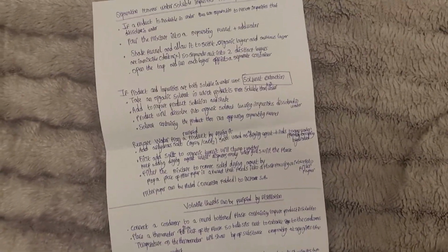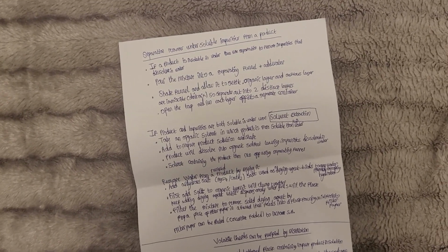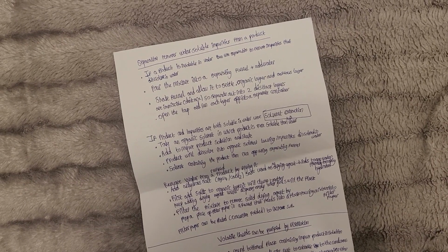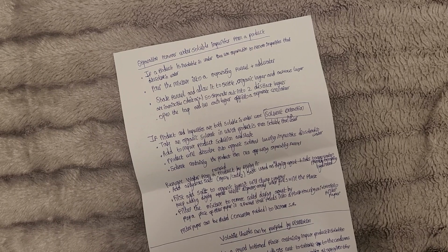AQA A-level chemistry practicals. Okay, so the first one, separation. What does separation do? Separation removes water-soluble impurities from a product. If a product is insoluble in water, then we use separation to remove impurities that dissolve in water.